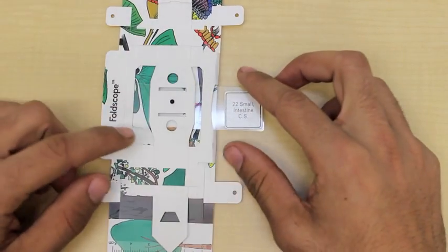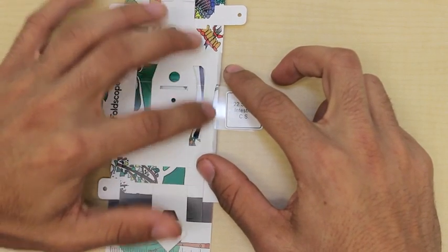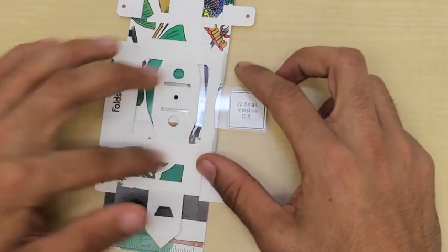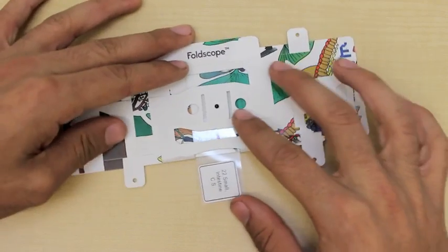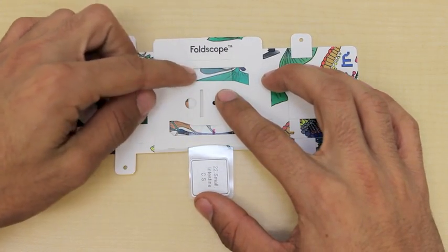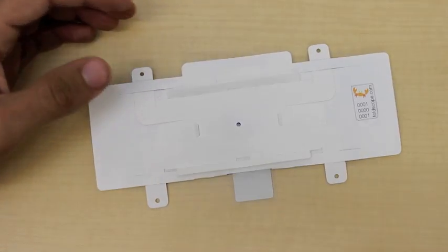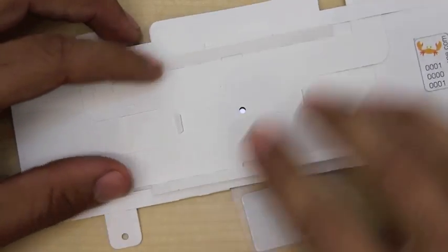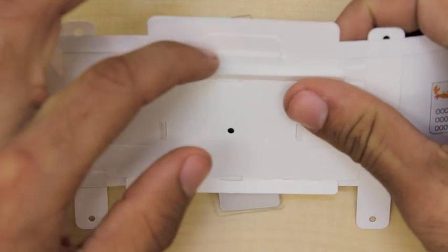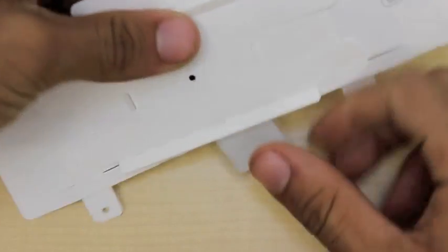As you're pushing in, make sure that the edge of the slide as well as the cover slip don't get caught on any of the pieces of paper or the plastic pieces of the lenses that may be protruding in this area. When you get to the top, you're going to have to insert the slide through a tight slit. If we flip the Foldscope over and I zoom in, you can actually see a slit right here, and this is where the Foldscope is going to exit as you push it through.